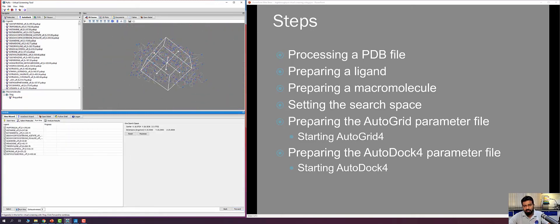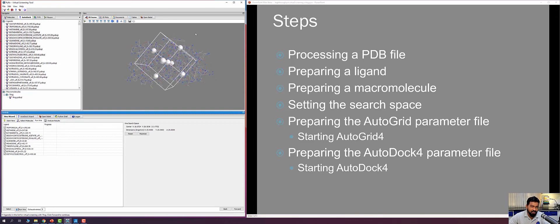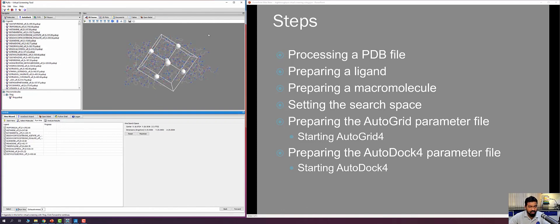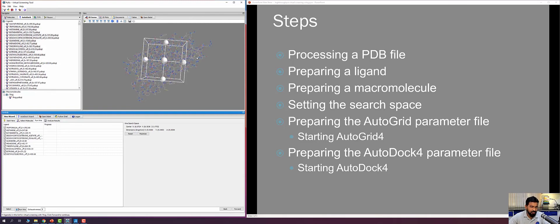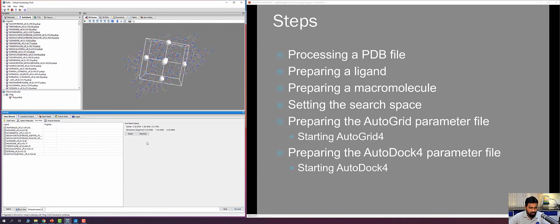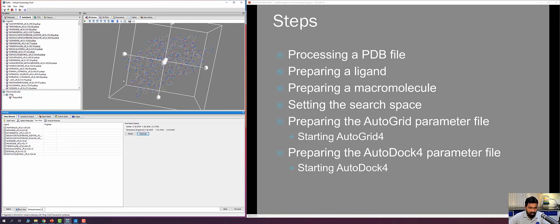This step involves setting the search space by defining the grid box. As in rigid and flexible docking, the grid box center is set to the binding site of 1HSG HIV protease. The grid box position and dimensions can be changed if needed. For this example the default values are perfect because they cover the entire binding pocket, so I proceed forward.